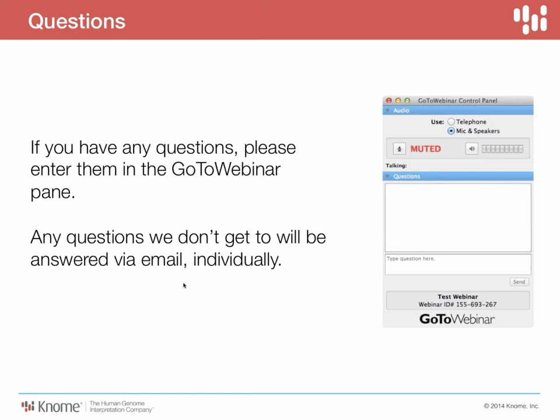So when GeneFinder is used to select genes, what it's doing is taking those search terms, and you could string together a collection of terms, and we'll look for them. It looks for those as substrings within disease names, disease synonyms, symptoms, and even the synonyms of those symptoms. So it looks quite broadly for those. There are other sources we're thinking of bringing in to allow a broader search for that information. But right now, as you see, that already captures quite a lot. Okay, thanks.